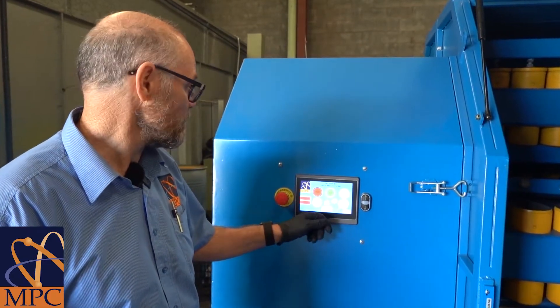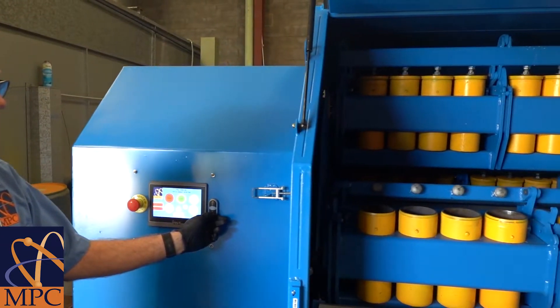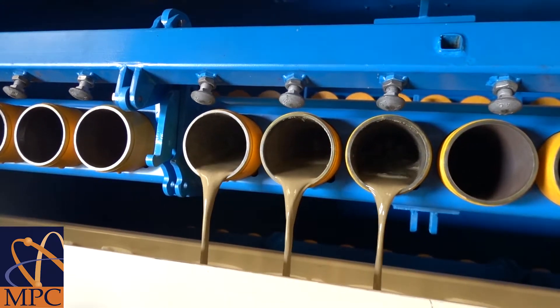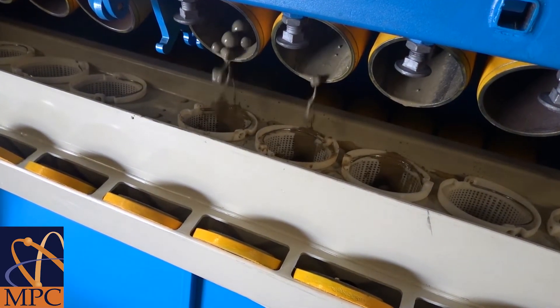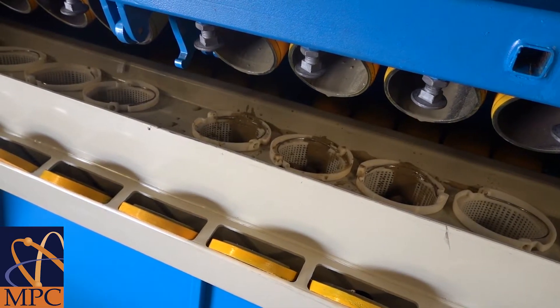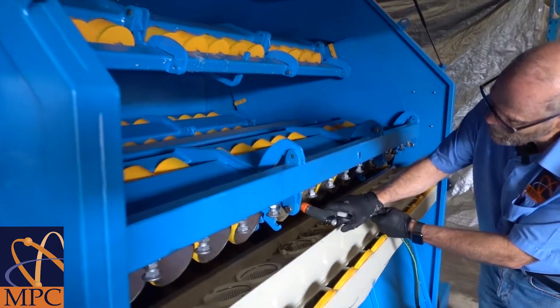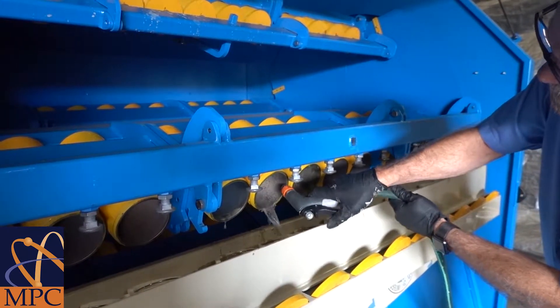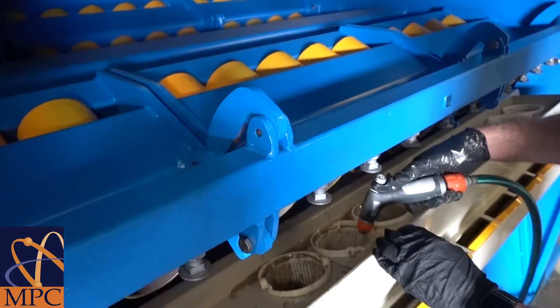Now we rotate the pots to empty the contents out so that we can clean the pots and the grinding media by pressing the tilt down button. Once the pots are emptied, we use a hose to wash the pots and the grinding media to remove traces of the previous samples.